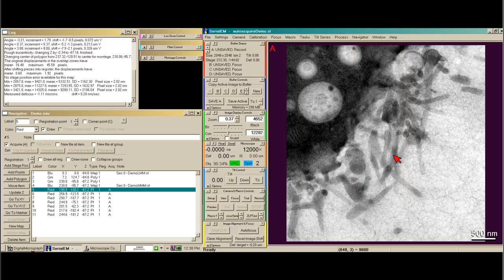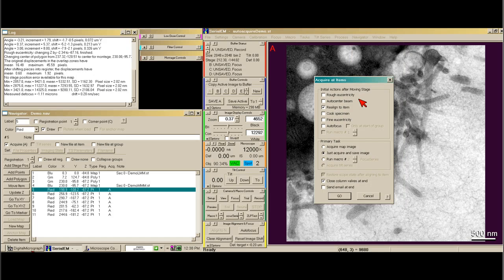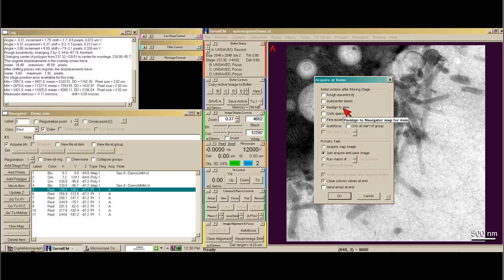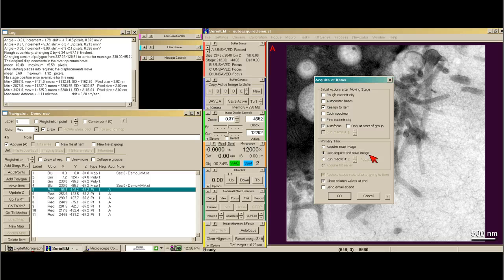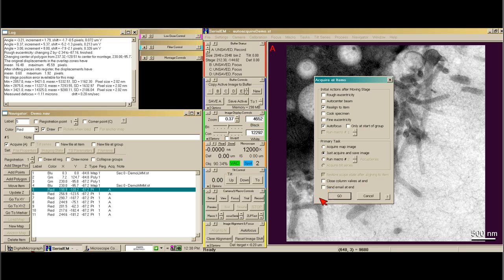I go back to Navigator and say 'Acquire Points.' One of the things I definitely want to do is autofocus before each image, and I want to realign to item. What this means is that it's going to take a series of images that re-centers exactly what you want in the image. You have to do this because there's a lot of backlash — without it, you'll get near it but not exactly at it. So we just acquire and save an image, and at the end you can have it close the column valves or even send you an email. Then we say 'Go.'